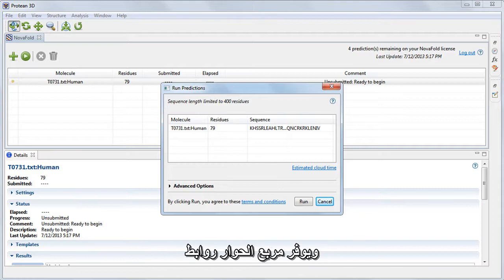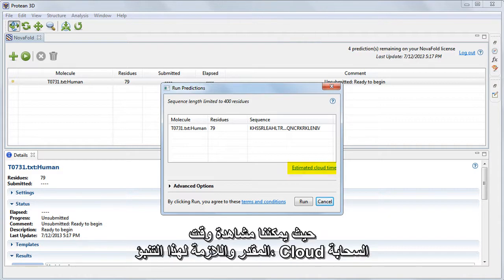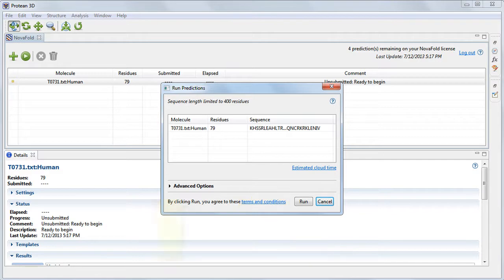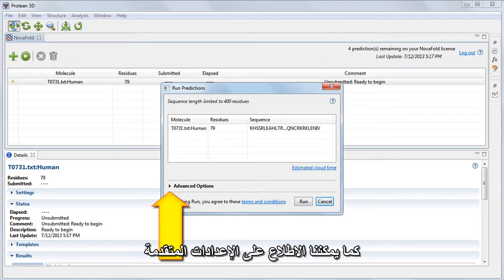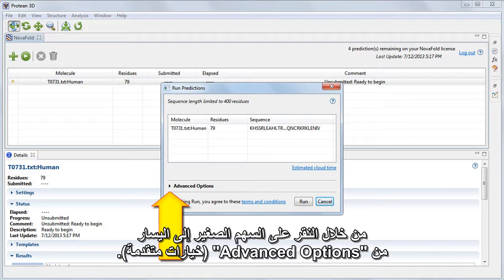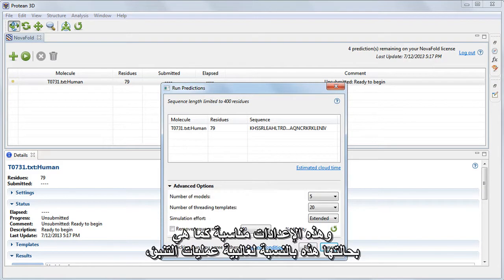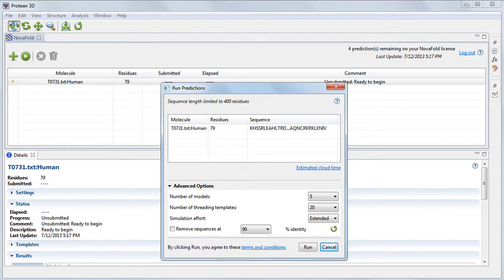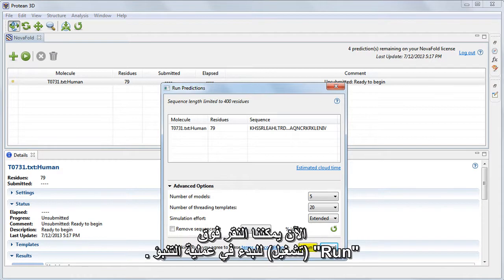This dialog provides links where we can see the estimated cloud time needed for the prediction, or to review DNA Star's terms and conditions. We can also access the Advanced Settings by clicking the small arrow to the left of Advanced Options. These settings are fine as is for most predictions, so we'll leave them at the default settings. Now we can click Run to begin the prediction.